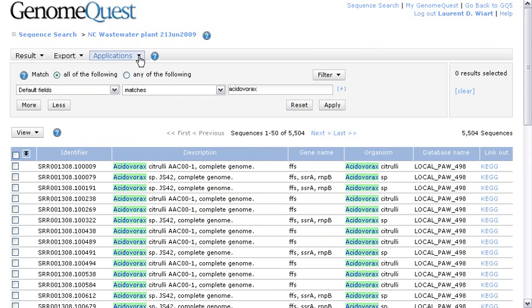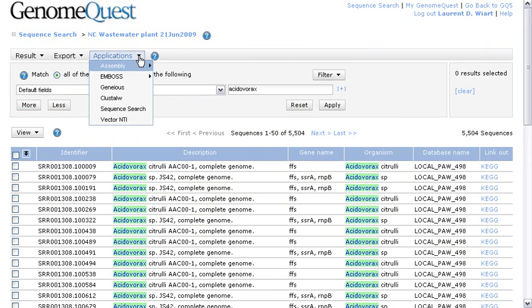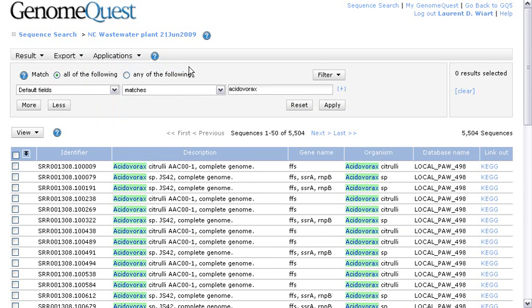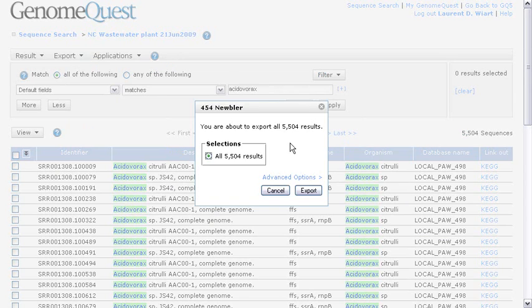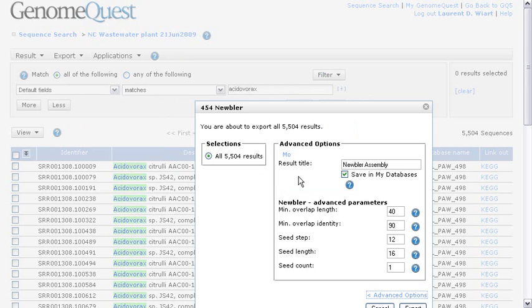Now, let's scroll back up, and go to the Applications to perform this assembly. As you can see, there's an option called Assembly, and I'm going to choose New Blur. Now, I can define a few more advanced options for New Blur.